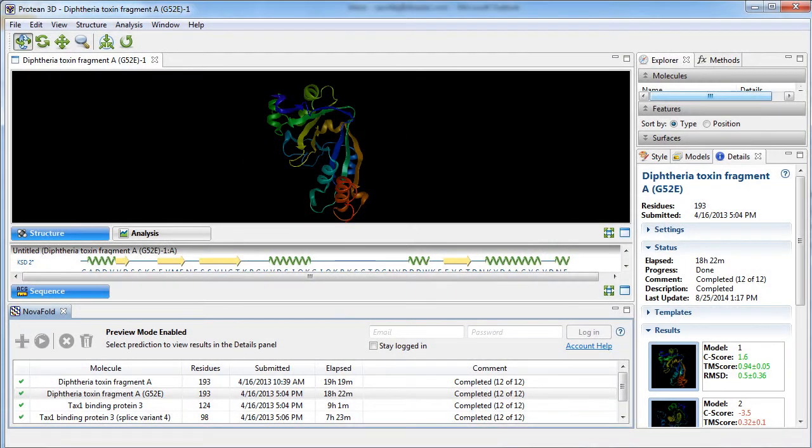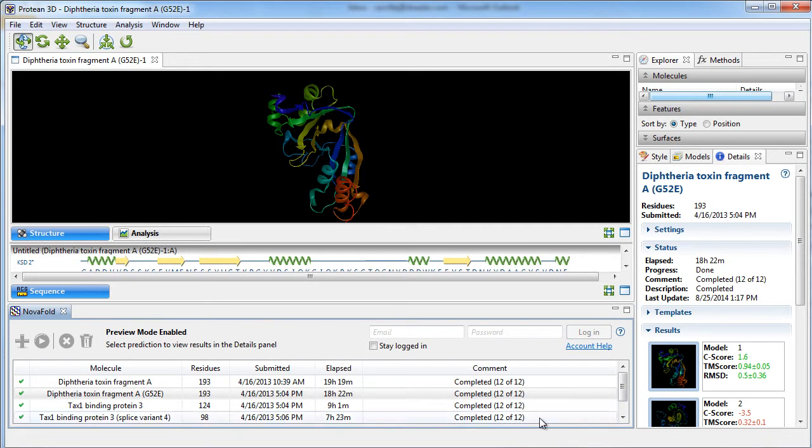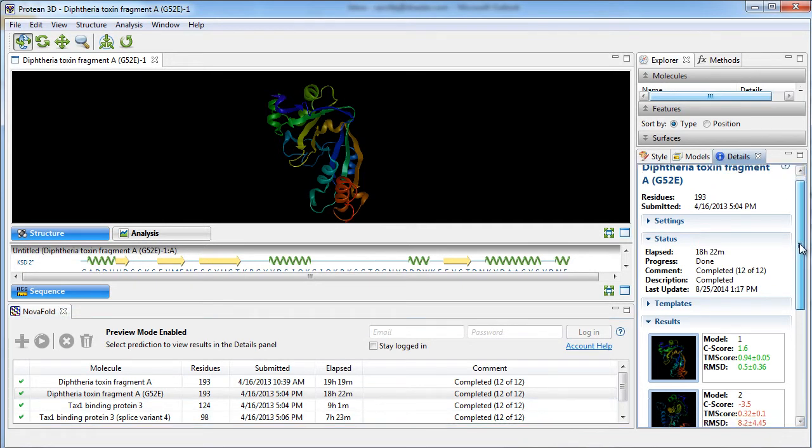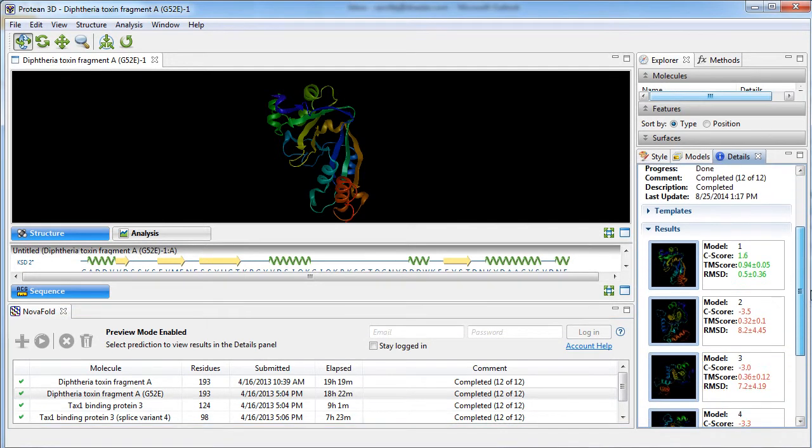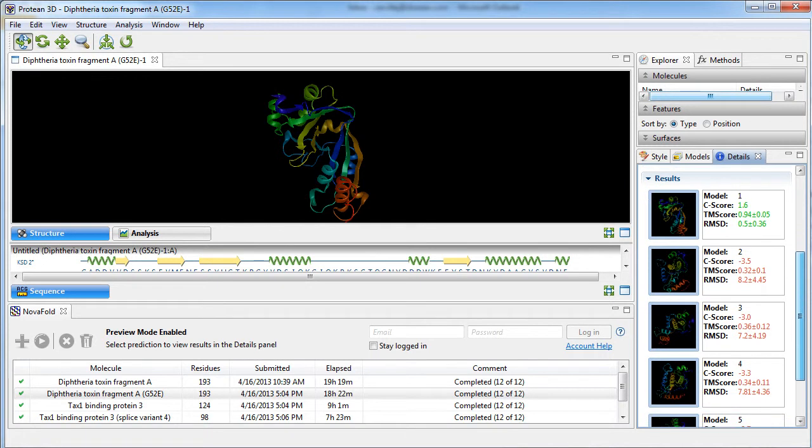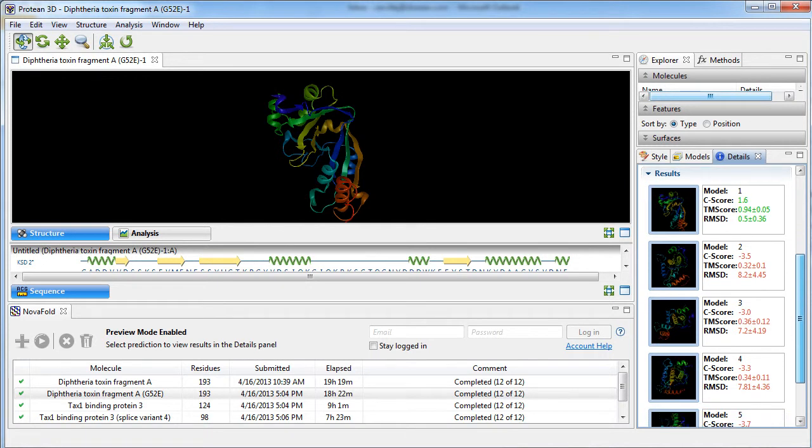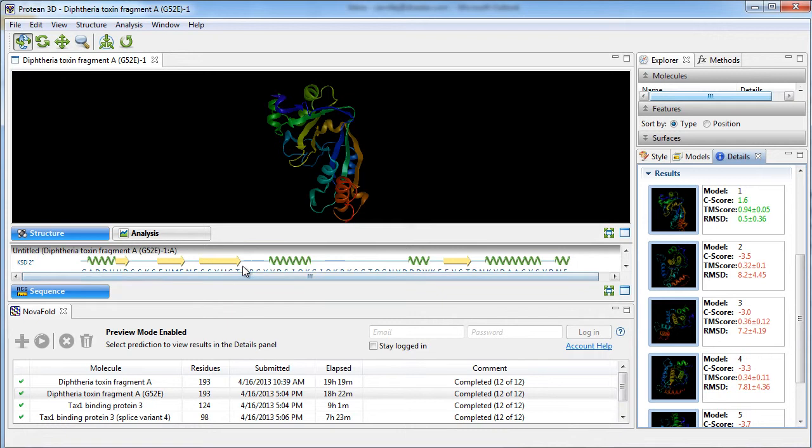Finally, this software suite provides access to NovaFold for protein structure prediction. This workflow utilizes the computing power of the cloud to perform fast and accurate protein structure predictions. Perform analysis on your predictions using a variety of different statistics and views.